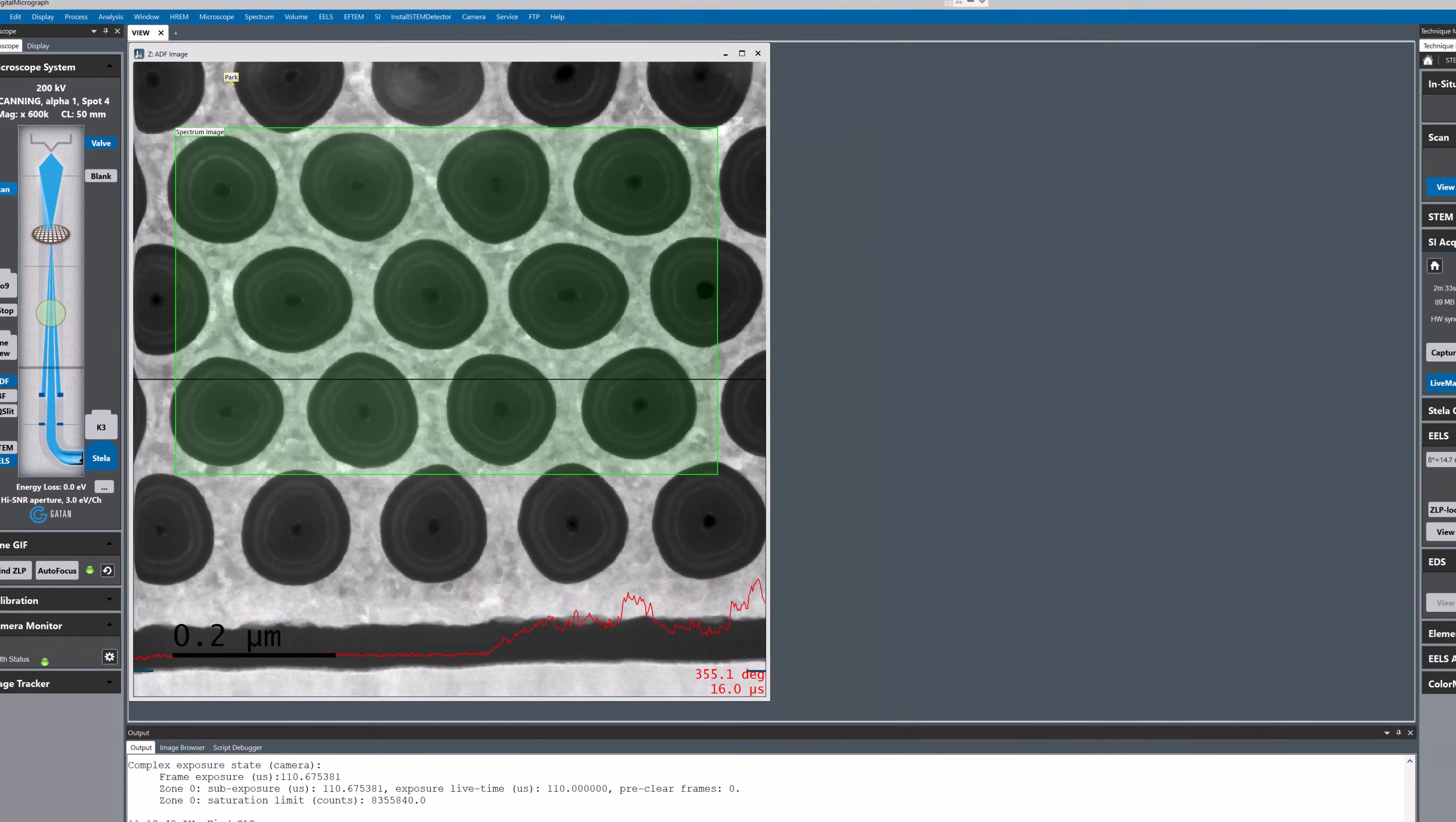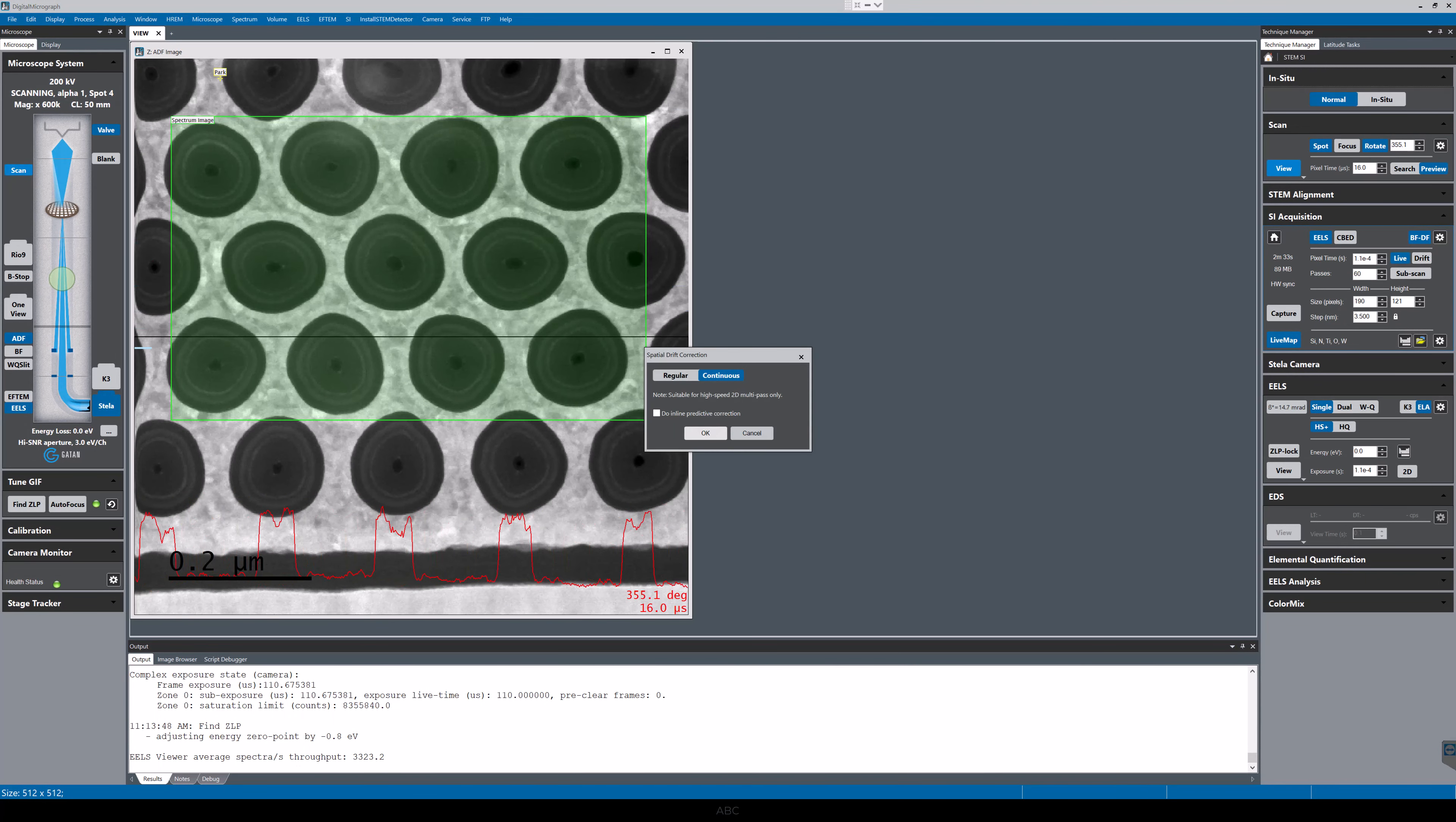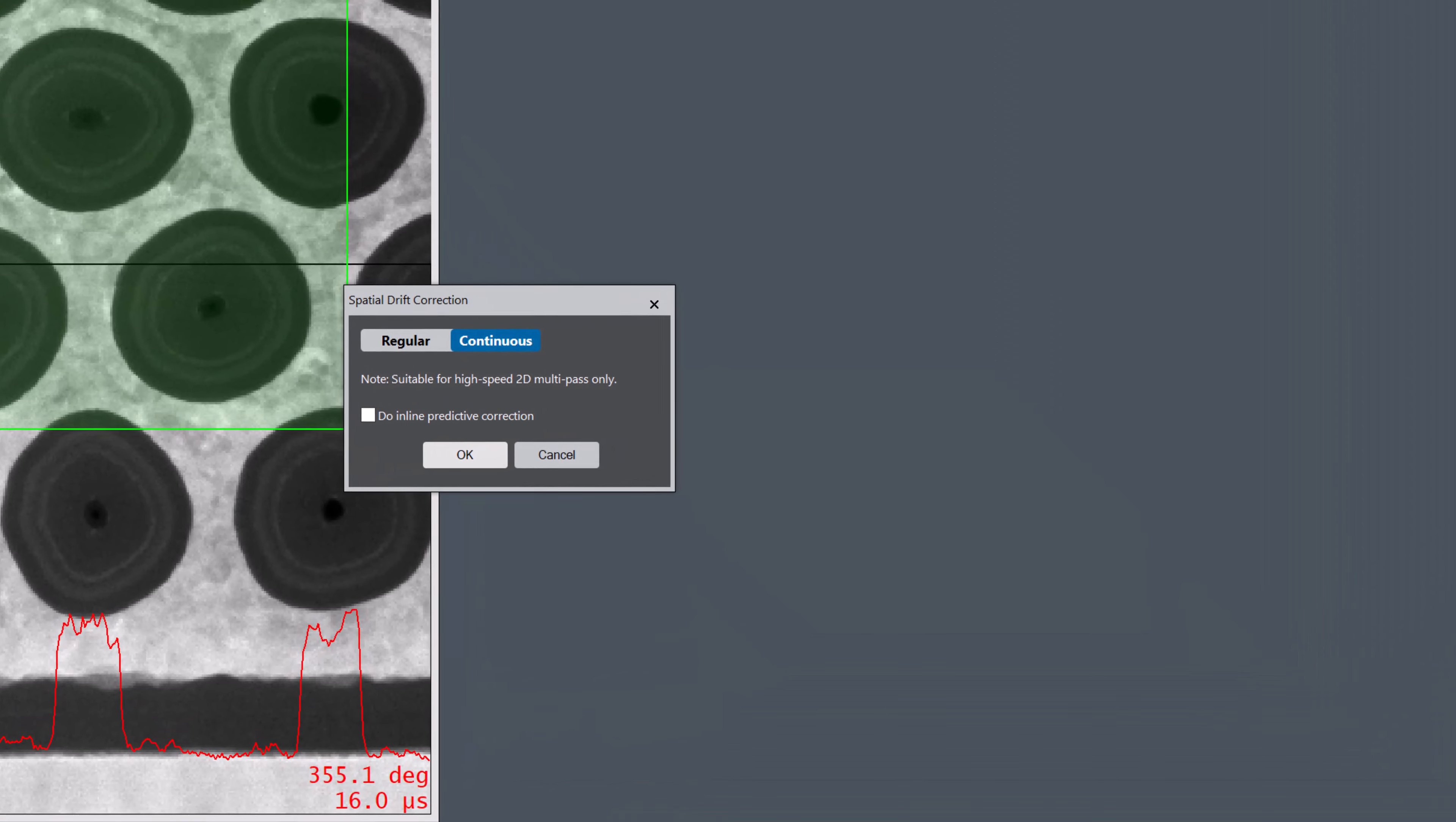To switch on Continuous Drift Correction, I just click on the Drift button in the Spectrum Imaging palette and then select Continuous in the next dialog that is shown.